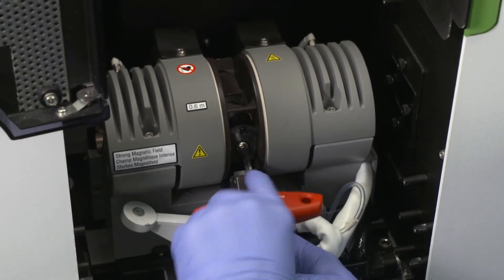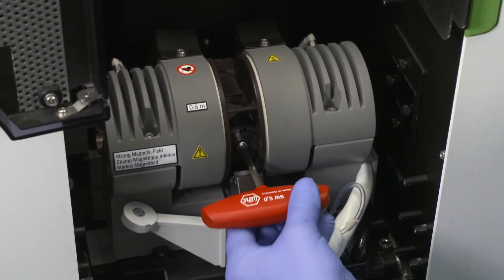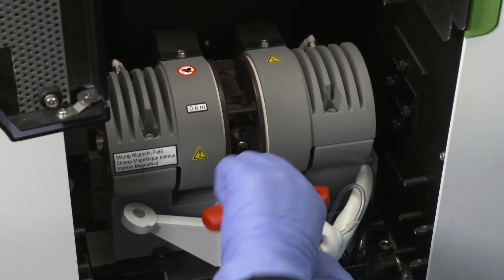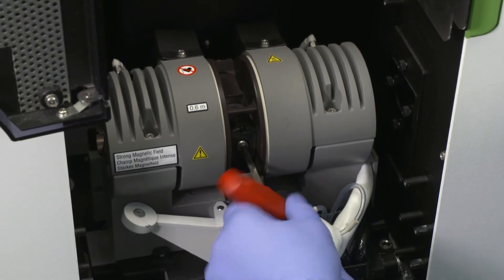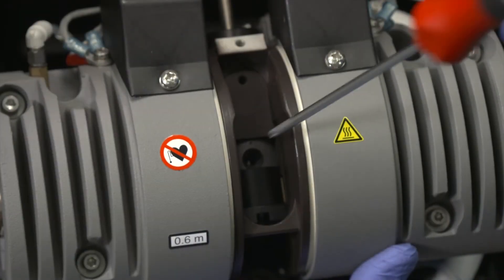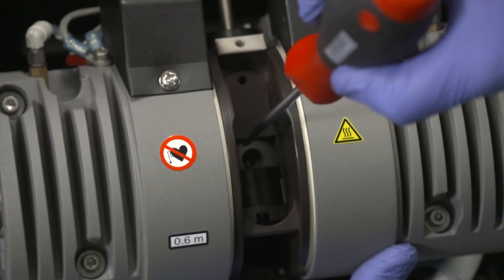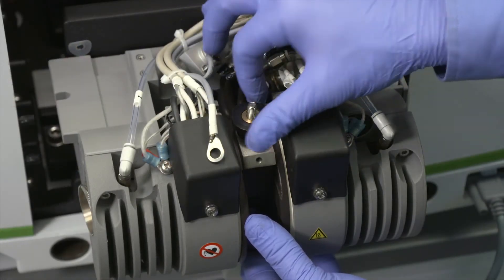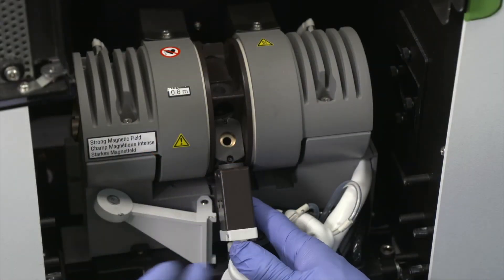Do not use excessive force to push this contact into the housing as it may shatter the contact. If there is substantial resistance, check that the parts are aligned correctly. Screw in the bolt until the contact is flush with the contact housing. Now screw the long bolt out of the threaded cylinder and carefully remove all of the tools.